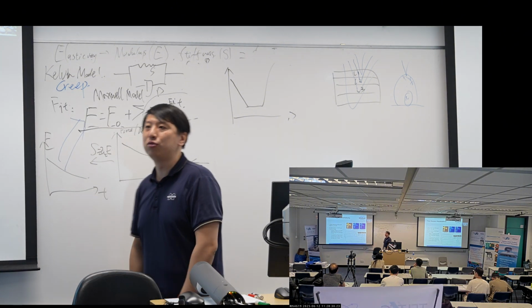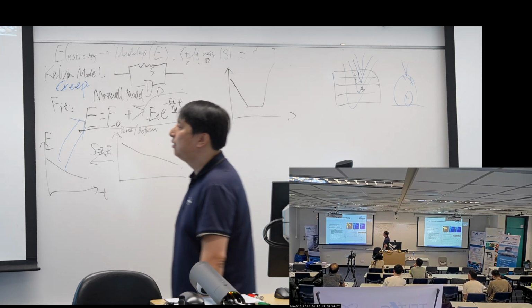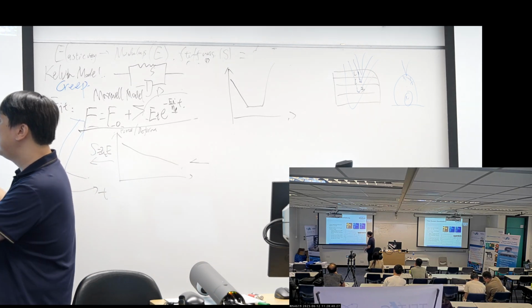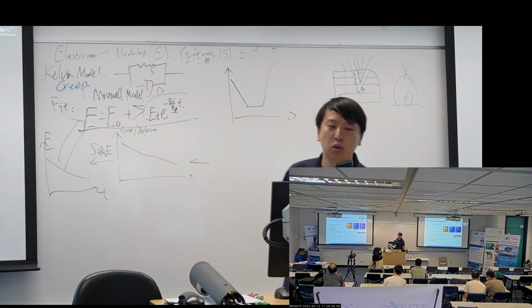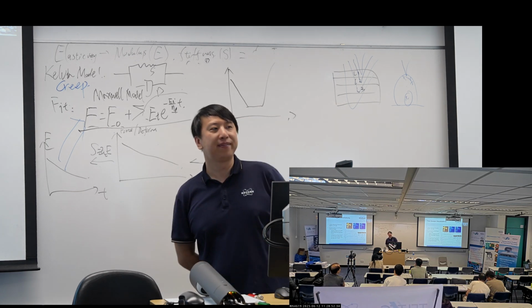And I think they published the results, and Bruker used this as an example of ramp and hold or ramp scripting to study the viscoelasticity.